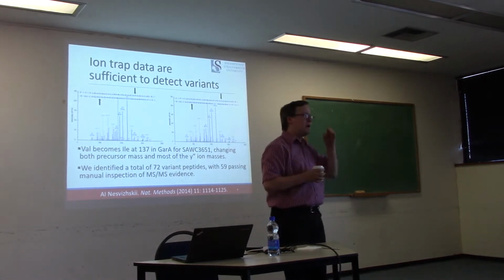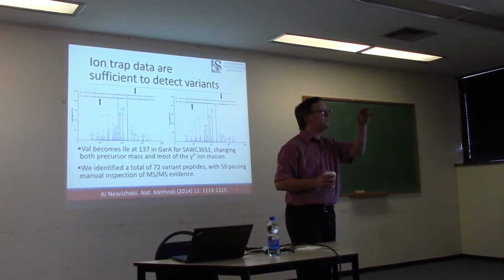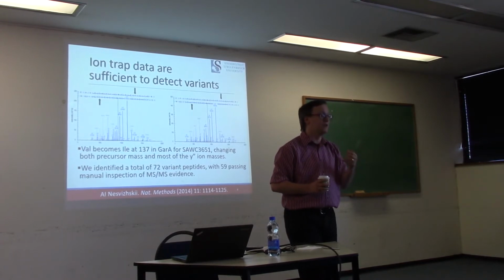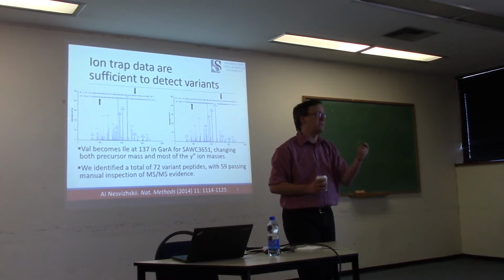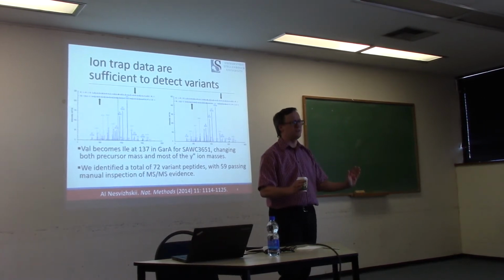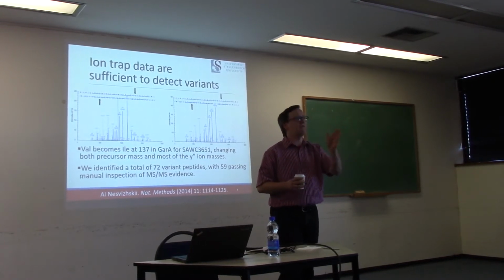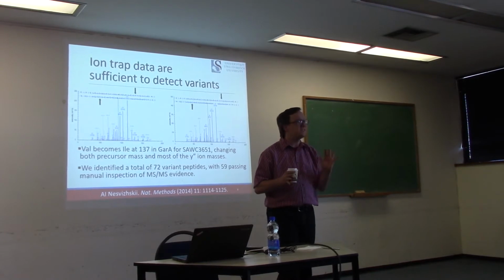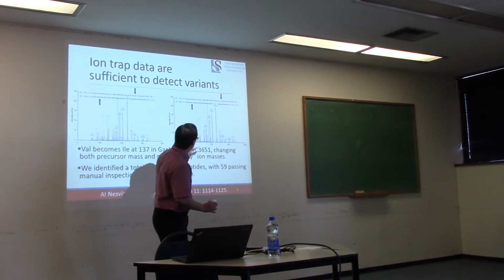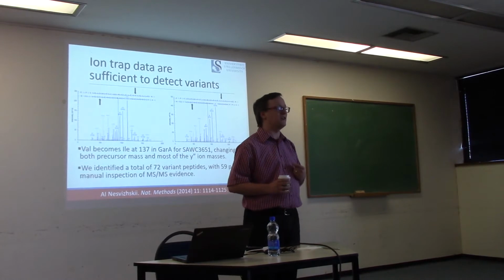All right. Now, I said that we collected these on our Orbitrap Velos, and the tandem mass spectra, the evidence for individual peptides, was collected via CID, so low resolution, low mass accuracy fragment ions. And a lot of people would say, well, now hold on, how are you doing anything with proteogenomics if you're going to be dealing with this large search space? Must you not have high resolution tandem mass spectra? Well, we still had accurate precursor masses, we just had low resolution fragment ions. And I would ask you, do the identifications we produced look implausible? I think you would argue that they don't.